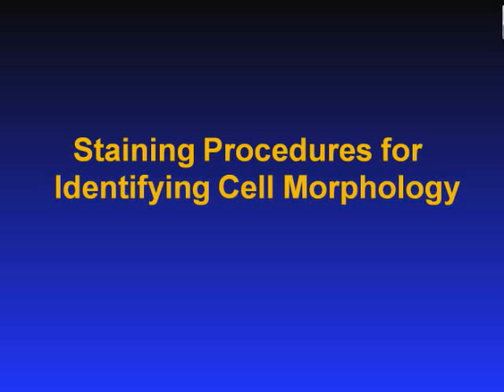That concludes our overview of culture procedures for this lecture. Now let's move on to staining procedures, which are designed for identifying cellular morphology.